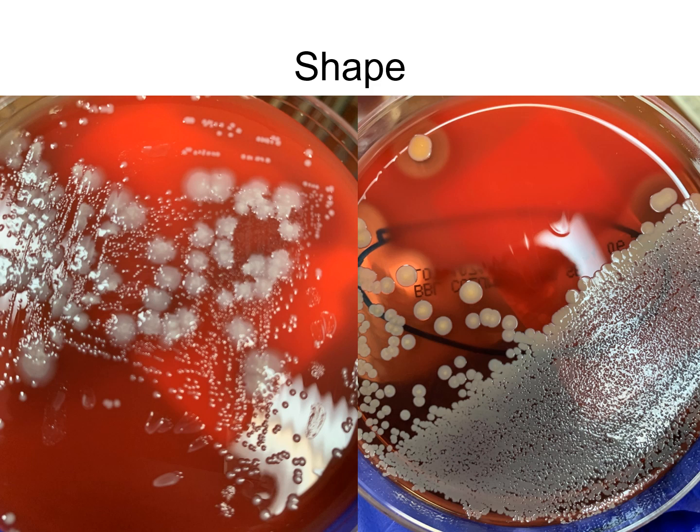Next, we look at the shape. Again, you have rounded shapes. Most of these over here that have a little bit of a yellow tone are round. You can also see some hemolysis with this plate, so you have a beta hemolytic organism here. And then if you look at this other image, you have some smaller colonies that look fairly round. The picture's a little blurry, but they look fairly round. But then these larger colonies are irregular, so you can see a little bit of an irregular shape to those.